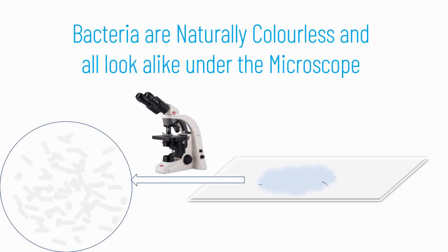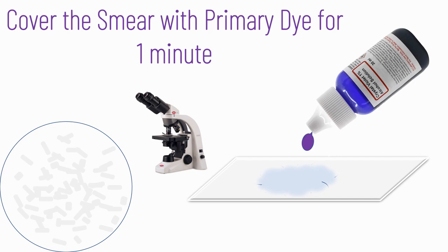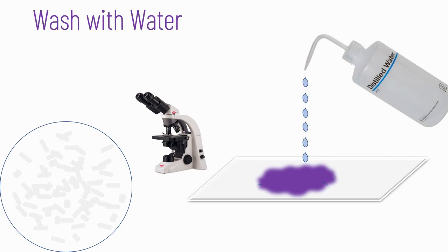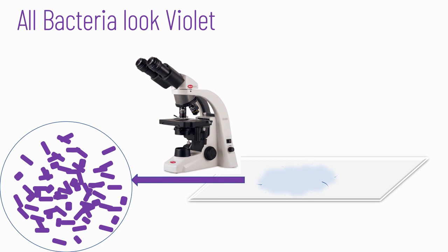Bacteria are naturally colorless and they all look alike under the microscope. The primary dye is added to cover the fixed and dried smear of bacteria and allowed to stay for 1 minute. Wash with water to remove the excess stain. The primary dye is taken up by all bacteria. If you observe the slide under the microscope, you will find all bacteria stained with the same purple color.